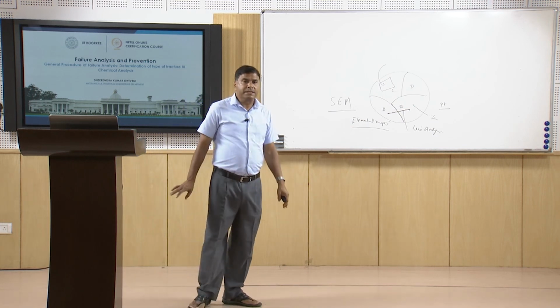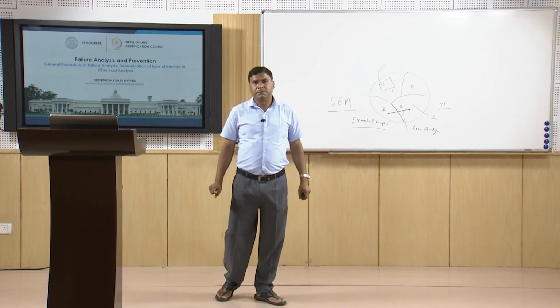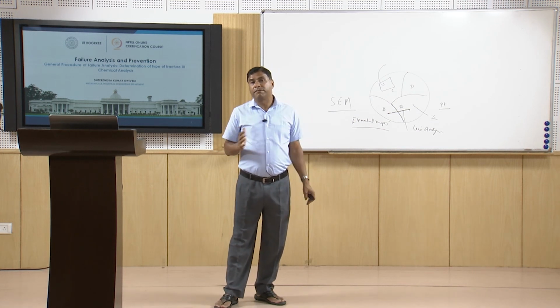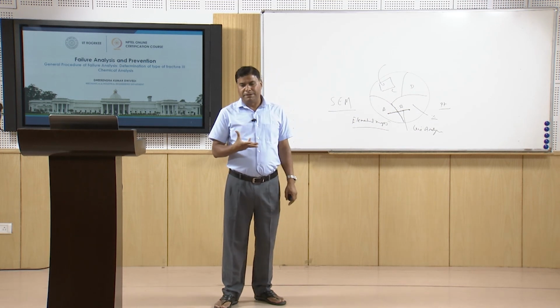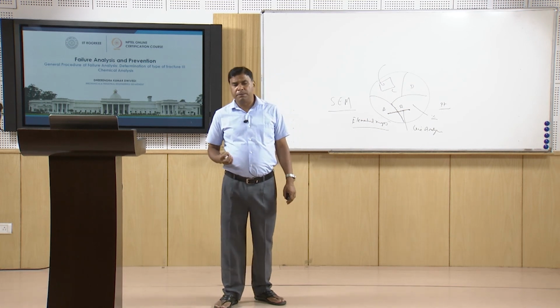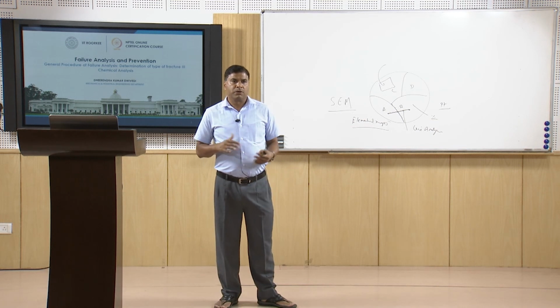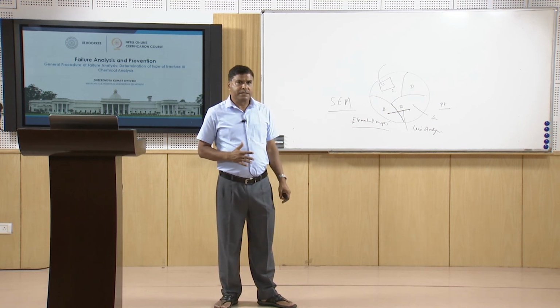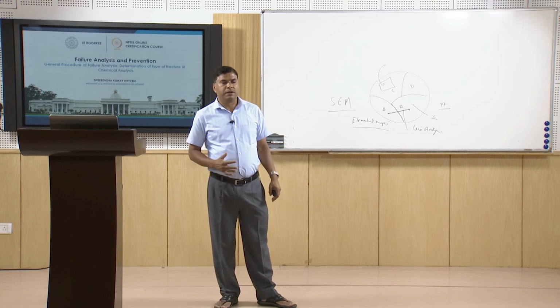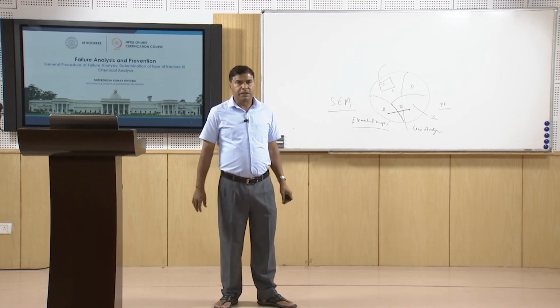Now, I will summarize this presentation. In this presentation, I have talked about how to determine fatigue fracture using suitable techniques like macroscopy and microscopy, and I have also talked about the importance of chemical analysis in failure analysis, and the different techniques which can be used for carrying out various types of chemical analysis.